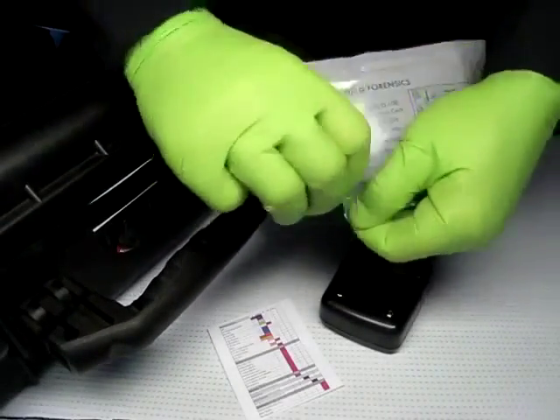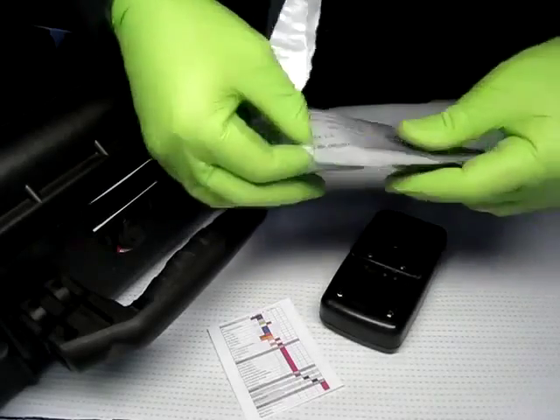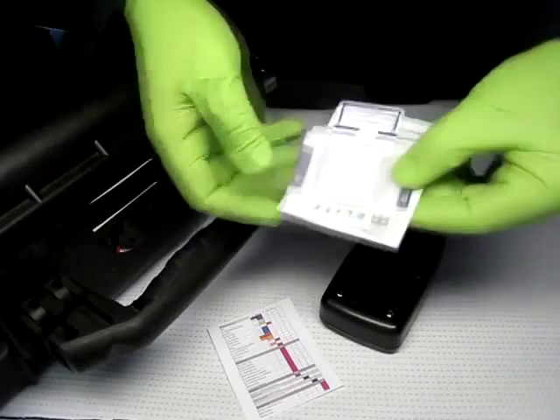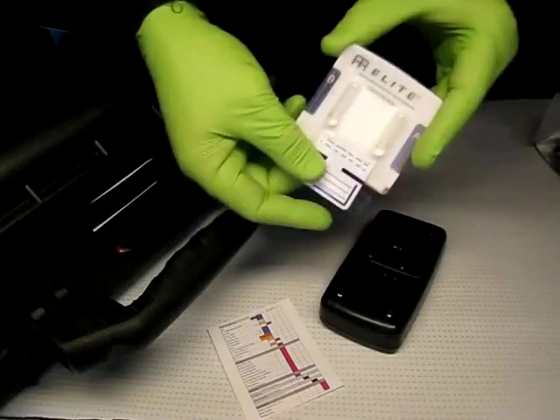This is a demonstration of the EL-100, a field detection unit that tests for a range of explosive chemicals. Here we're testing for RDX.